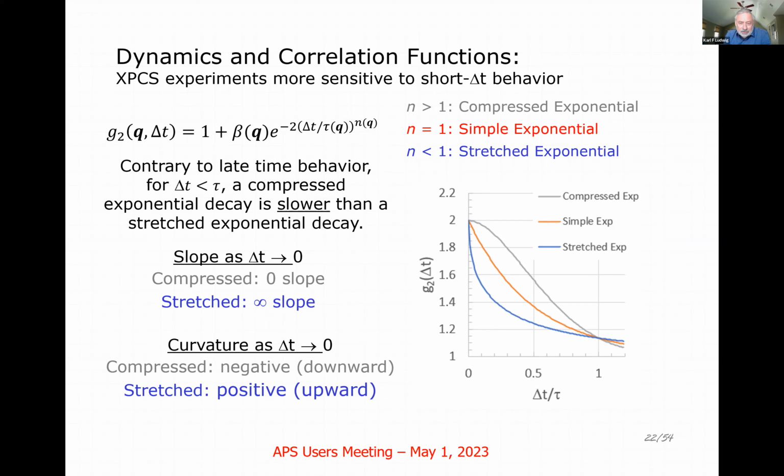For a compressed, oops, I see I have a mistake here. A stretched exponential is below the simple exponential. For a compressed exponential, that's the gray line here. I really need to fix this slide. The compressed exponential is actually above a simple exponential for short decay times.